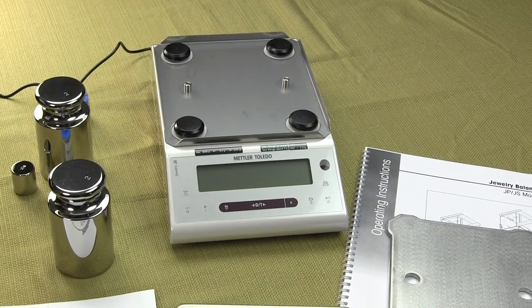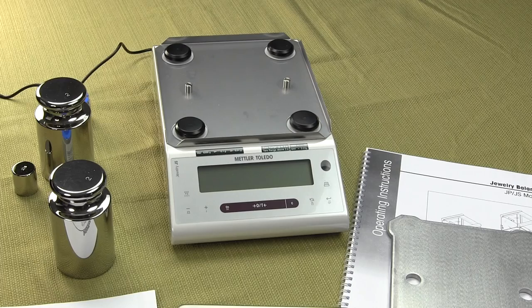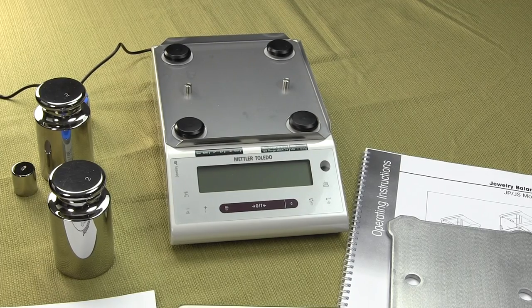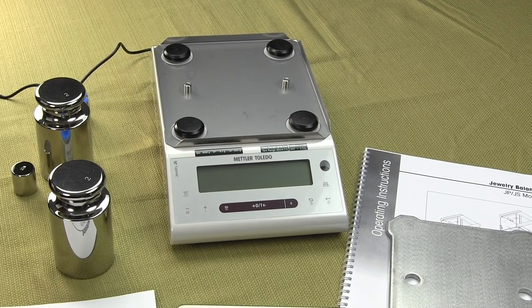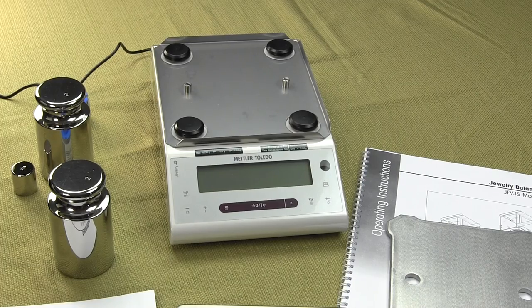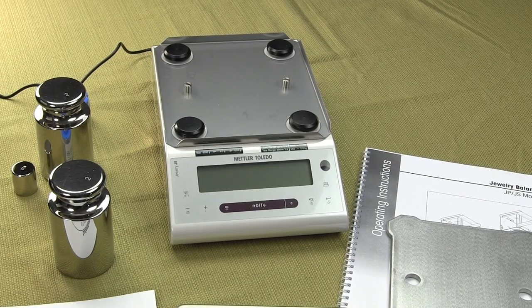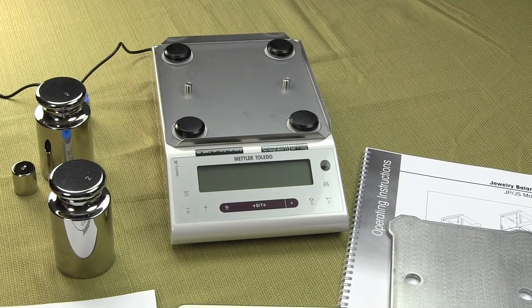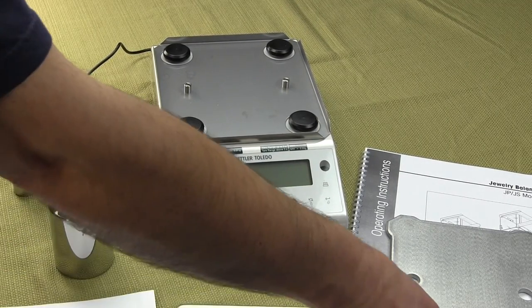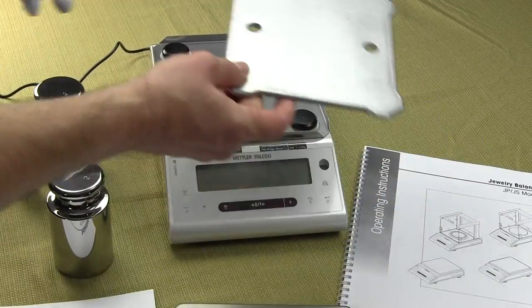And again, we covered that it has the LCD display. Battery power is awesome. It is legal for trade. It's legal for trade in grams, carats, pounds, ounces, troy ounces, and pennyweight. So these are some of the highlights of the brand new Mettler Toledo JS series.